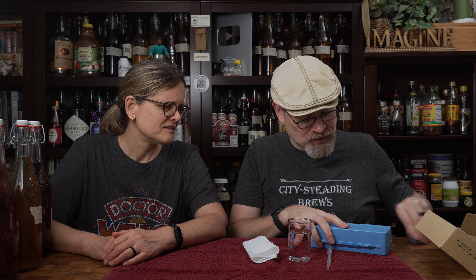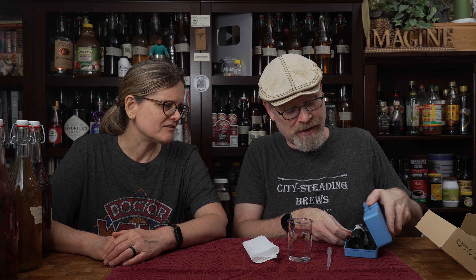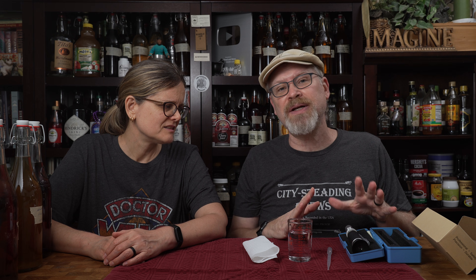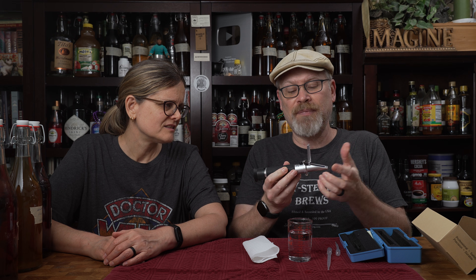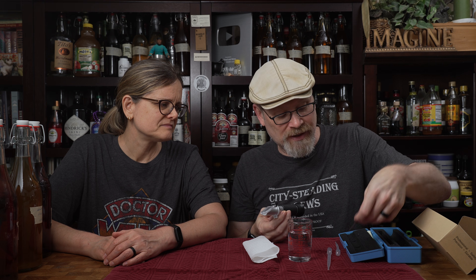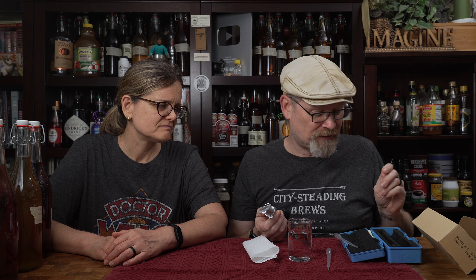Right off the bat the box broke already — just the latch, it comes off apparently. But it snaps back on. It is a really nice unit, about 20 bucks on Amazon. It's a lot like most of the others we've tried. It's ATC, comes with the adjustment screwdriver. I calibrated this just so you know — it actually was slightly out of calibration, not by much, about two points. It comes with a pipette and all that kind of stuff.